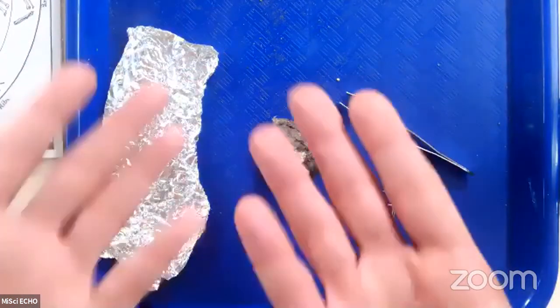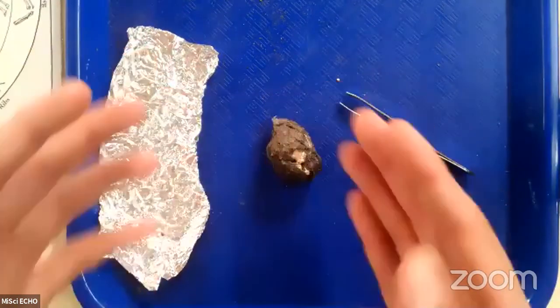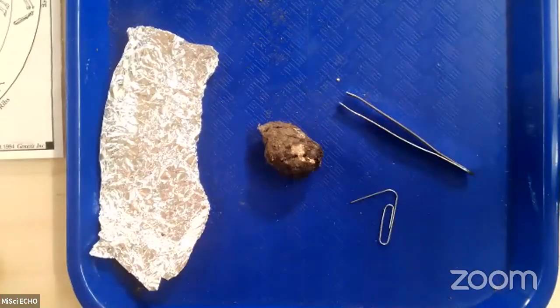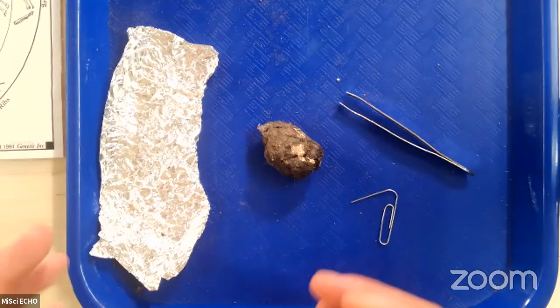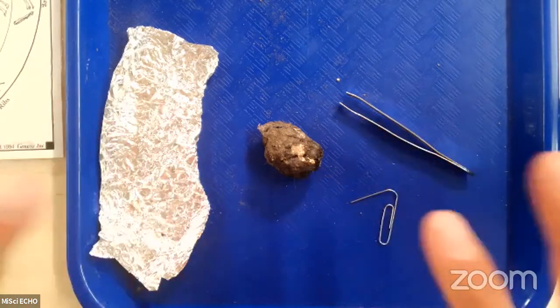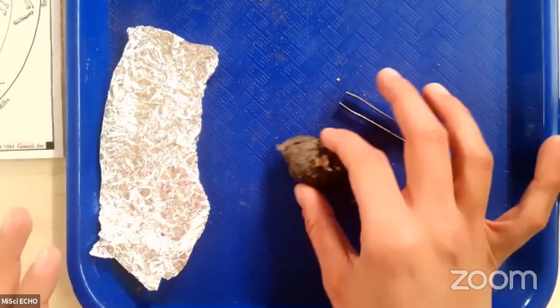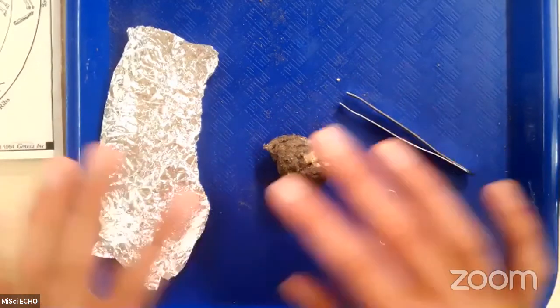And you might think it's kind of gross that I'm touching it with my hands. It really is easier just to use your hands during this dissection. And these owl pellets come to us autoclaved, which means that they've been baked or exposed to really, really high temperatures for a very long period of time, which is long enough that no living bacteria or organisms or larvae or anything like that could survive inside this owl pellet. So this owl pellet is completely sterile, it is sanitized, and there is nothing to worry about.